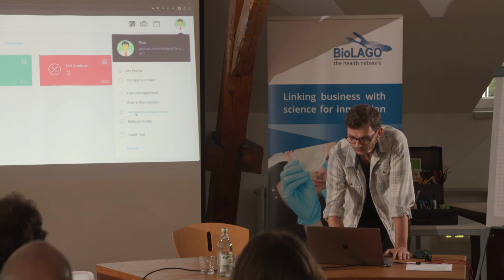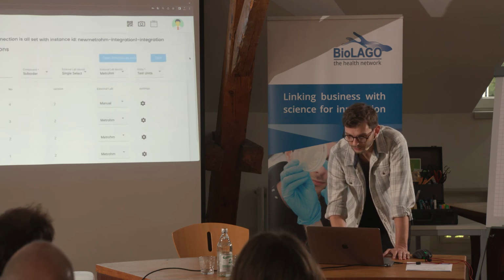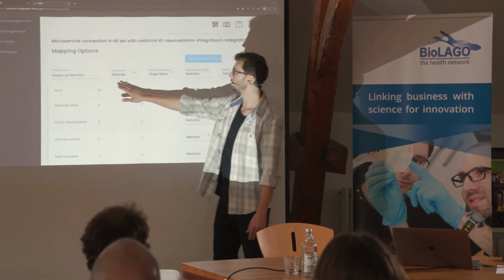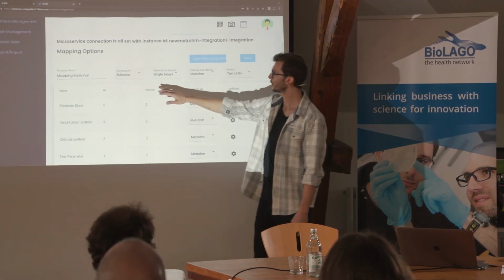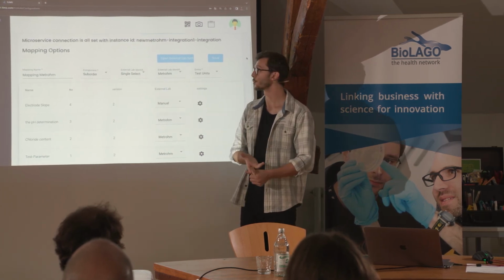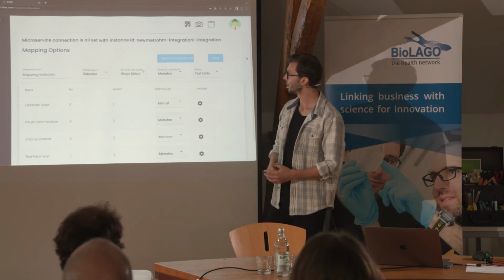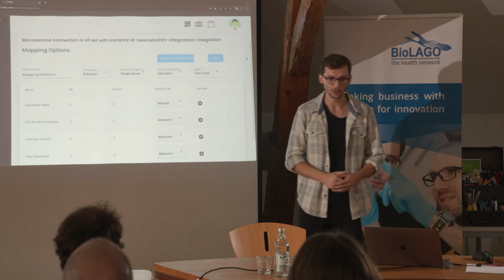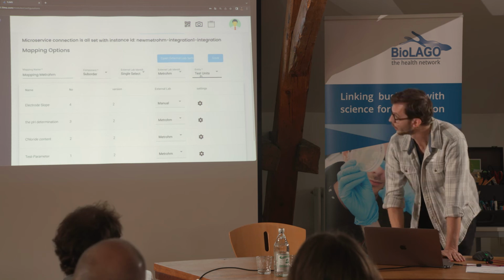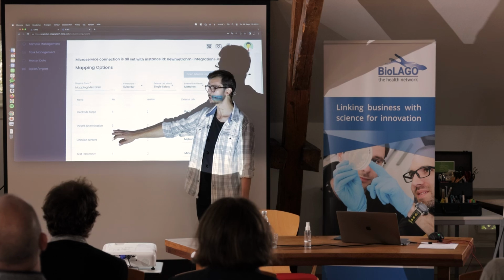I want to give you an example of a user interface, how a mapping could look. You can choose what kind of mapping settings you want to do, with which kind of component. Then, if you want to connect with a device, an external service, or even an ERP system, you have to define it here. And here you then select what type of device it is. And I can choose here the test unit. A test unit is called a parameter. Everyone knows what a pH determination is.